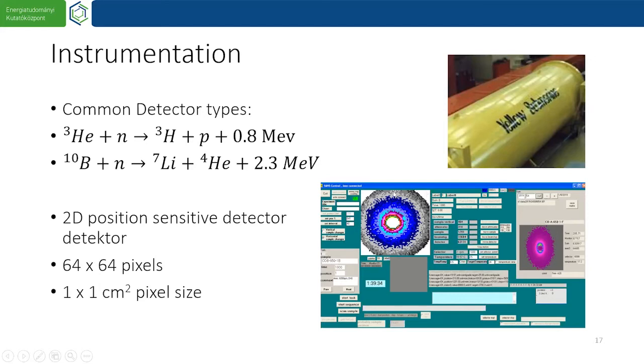So here in the corners there are no active pixels. The color map corresponds to the intensities. In this picture, dark gray means small intensity. Light gray is higher intensity, and blue and red is even higher intensity.